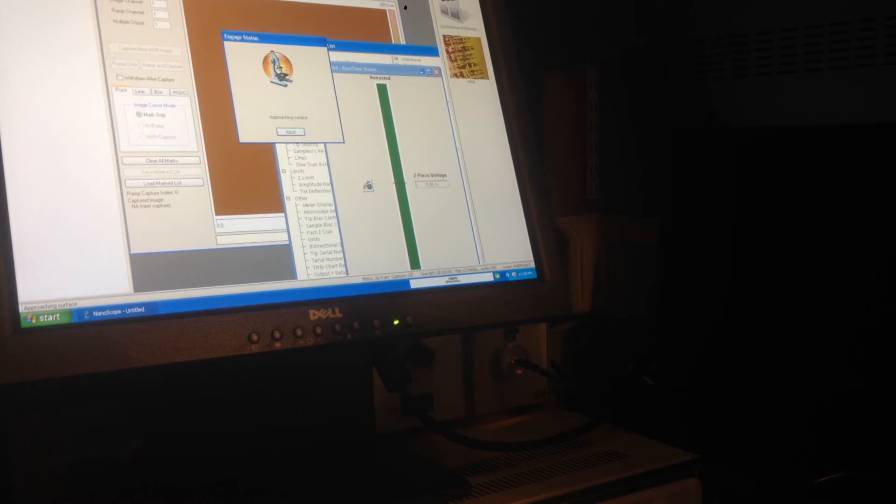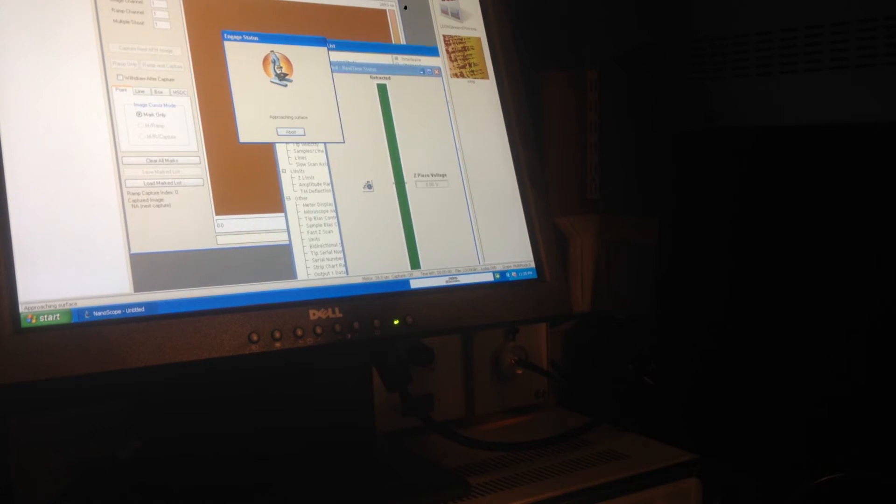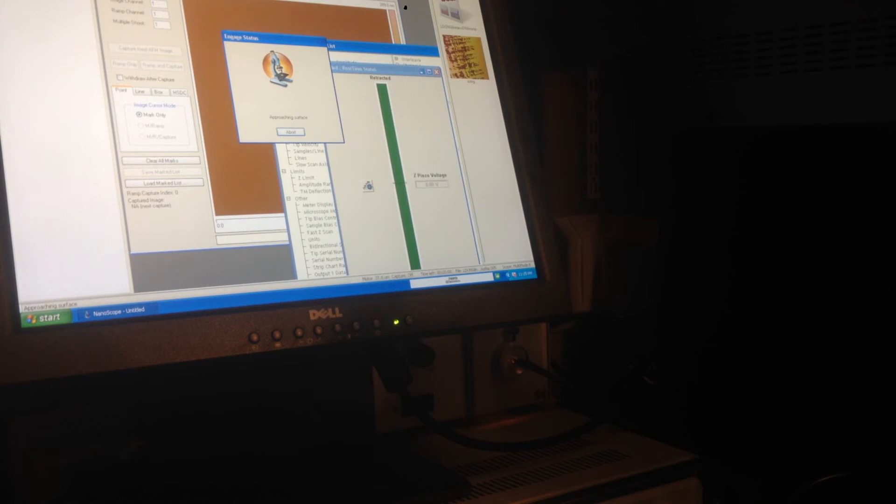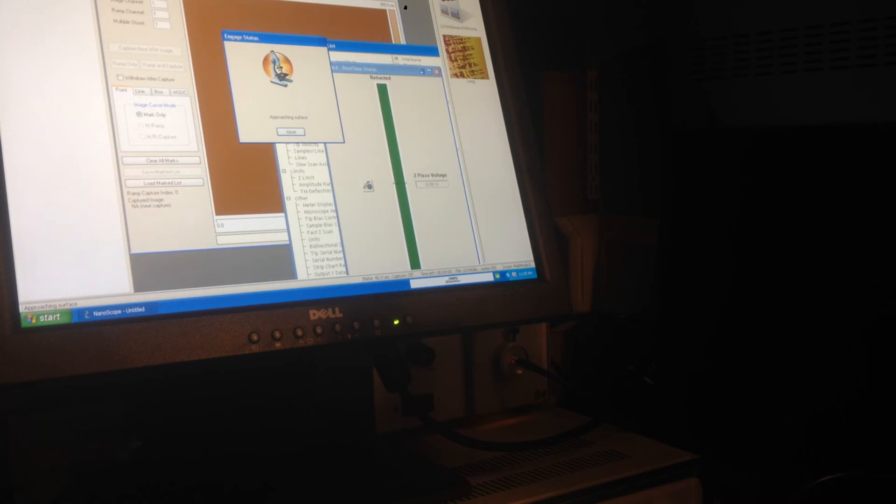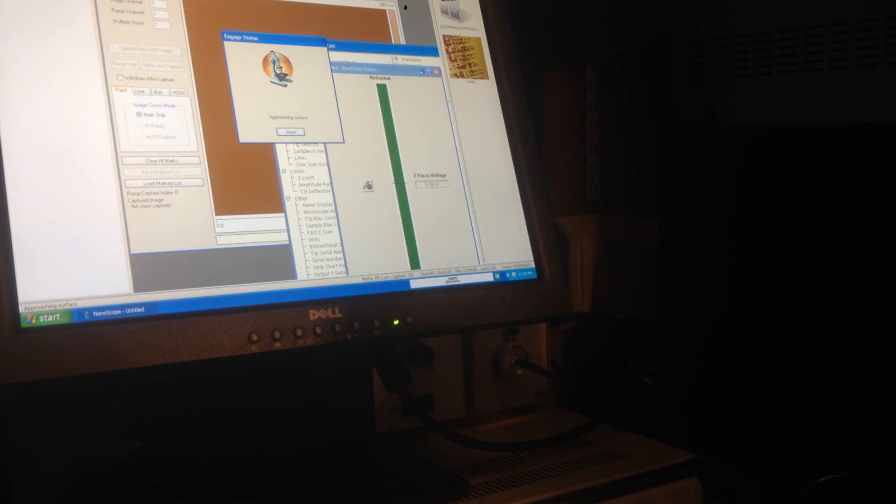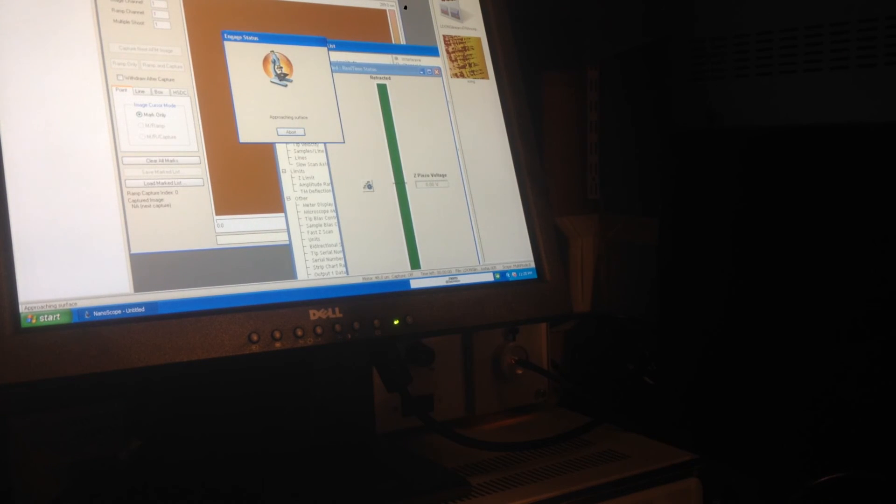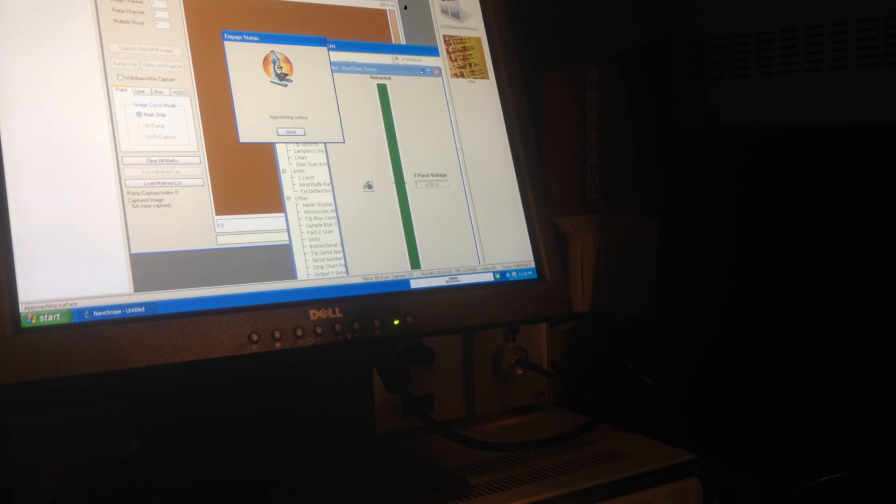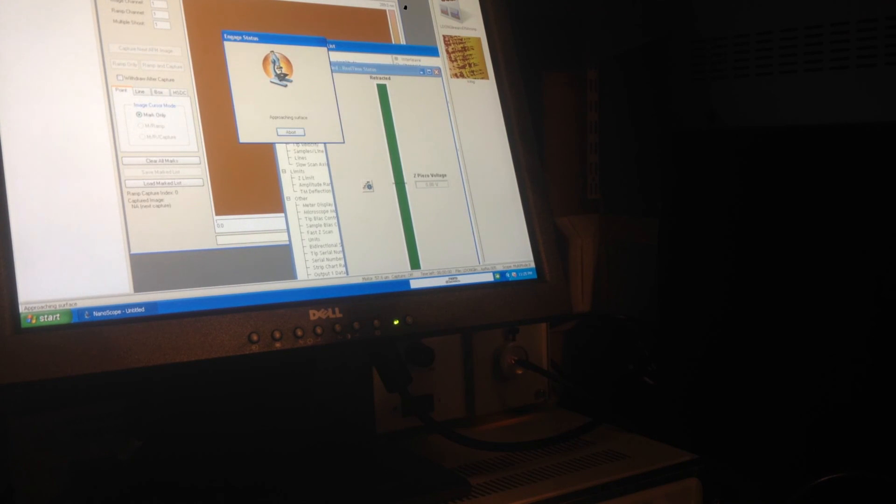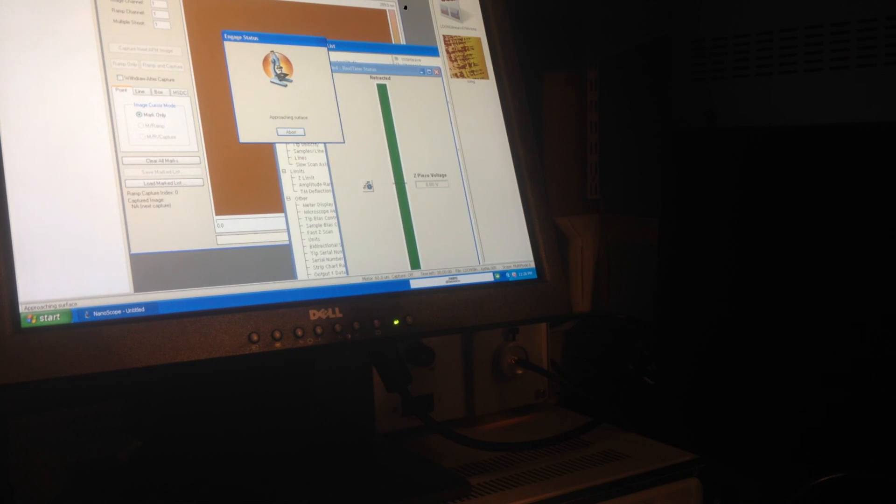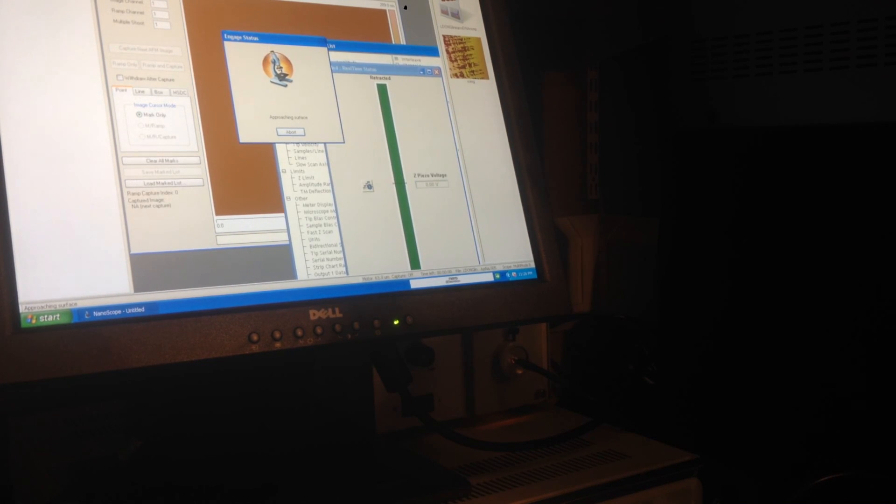Yeah, this is like the first time I've done imaging with an AFM, so I'm no expert. But yeah, these are my notes, mostly for me actually. So if anyone else finds it useful, that's kind of a bonus. I think I'll probably leave it there. Like I say, there's another video on the actual imaging. It's not too difficult - you kind of press buttons and it goes. But fiddling with the parameters to get a decent image was not so straightforward.